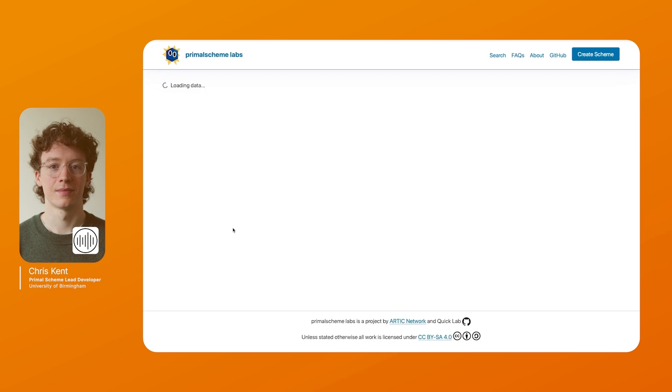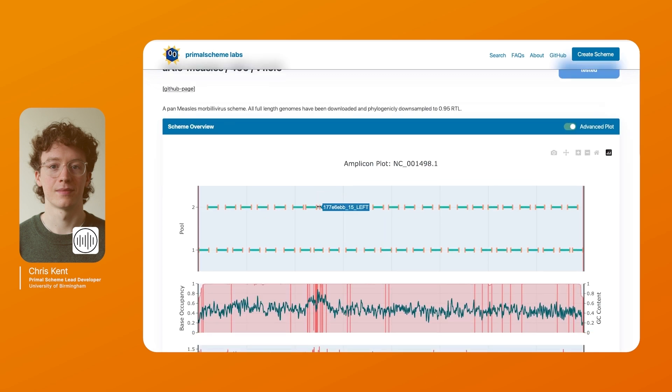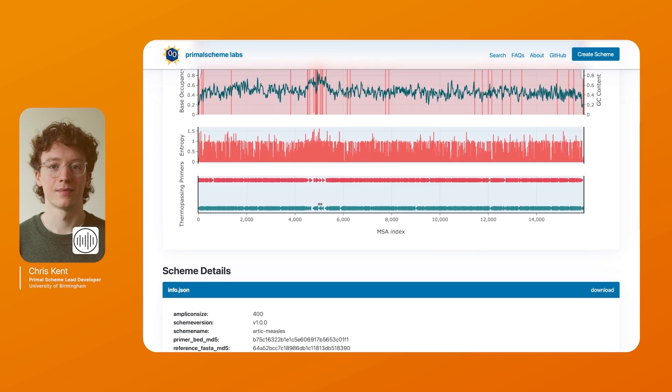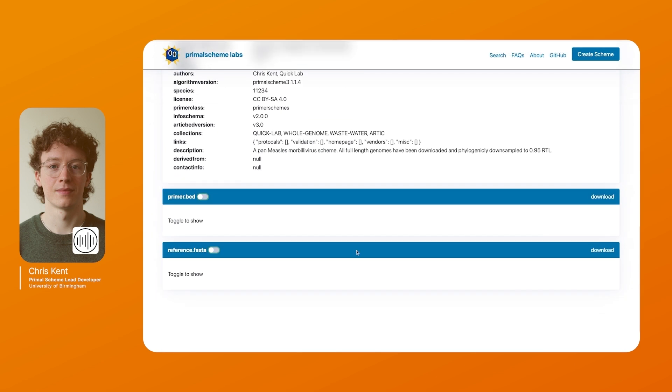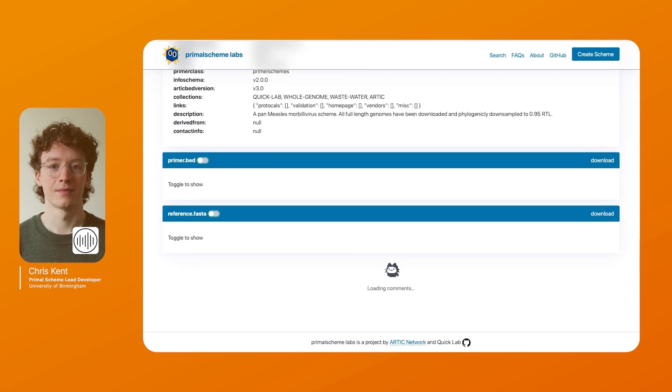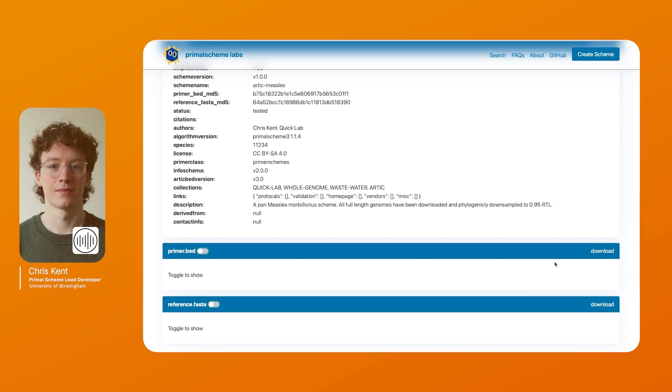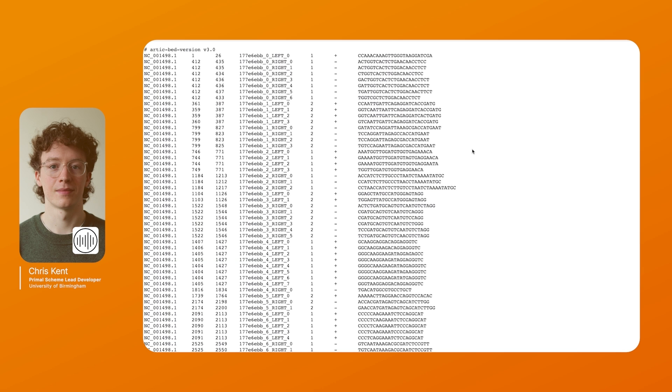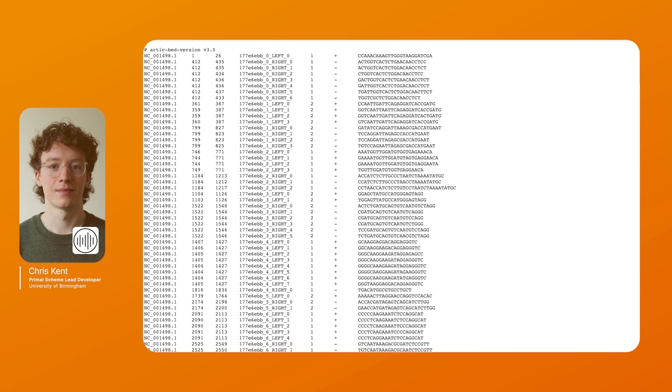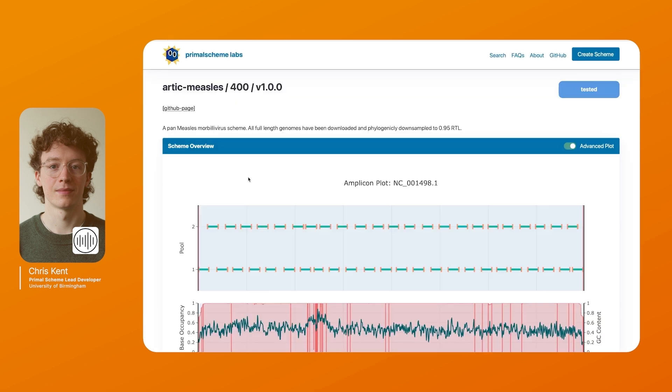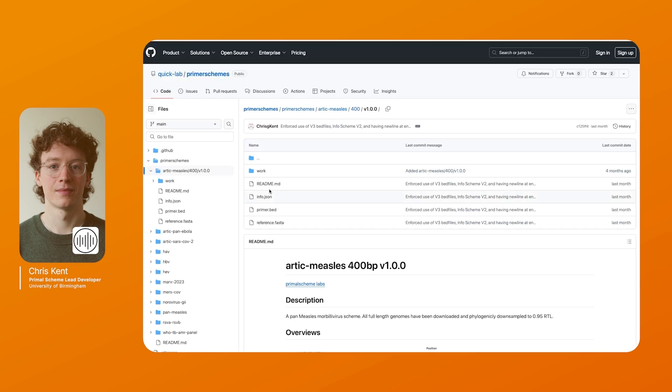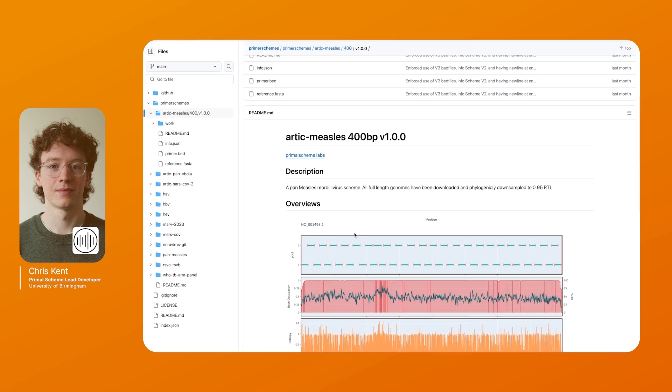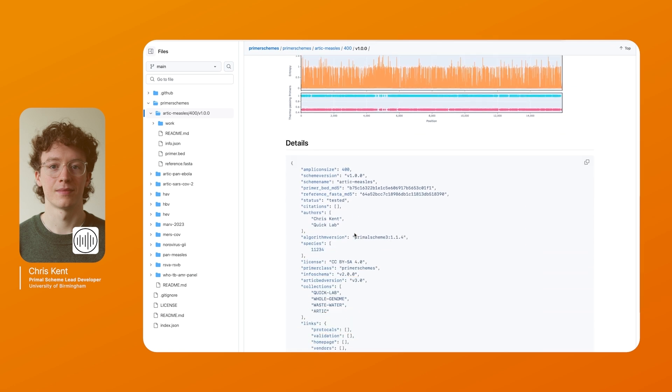Once you click on a scheme it will show you a quick overview of how the scheme looks and how it tiles across the genome. It will then provide a bit of metadata and it will provide you links to the key files for Primer.bed file and the reference file. So when you click on a download link it will redirect you to the text file of the bed file hosted on github. You can also access this file by clicking on the github page and you can see the files listed here alongside the overview and metadata, and provides the raw version controlled files used in the scheme.